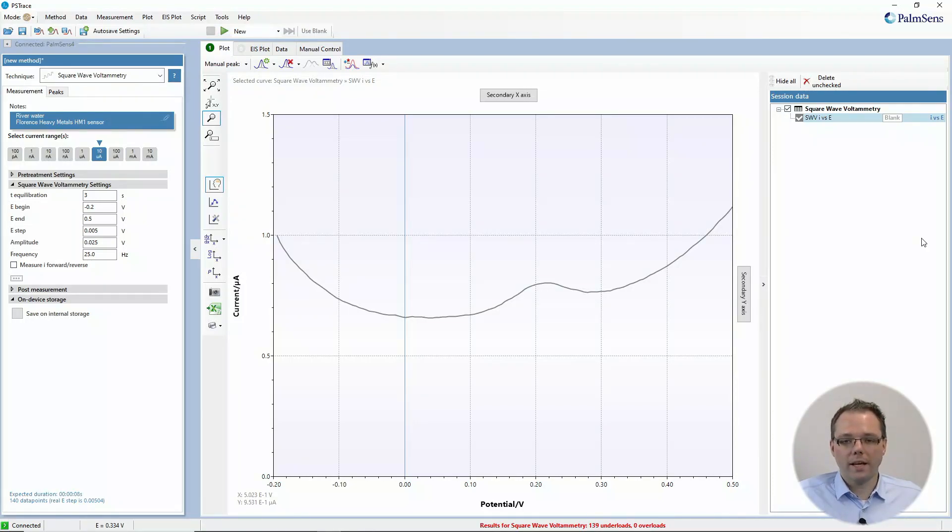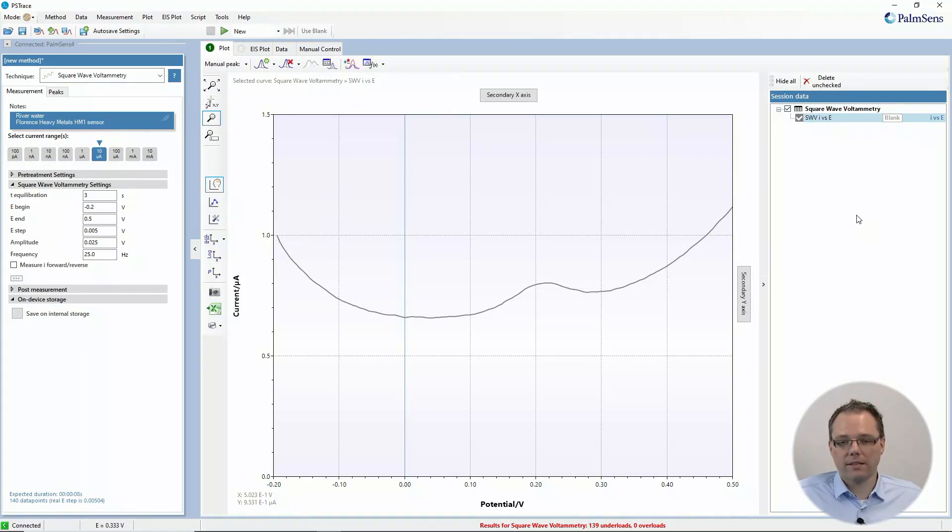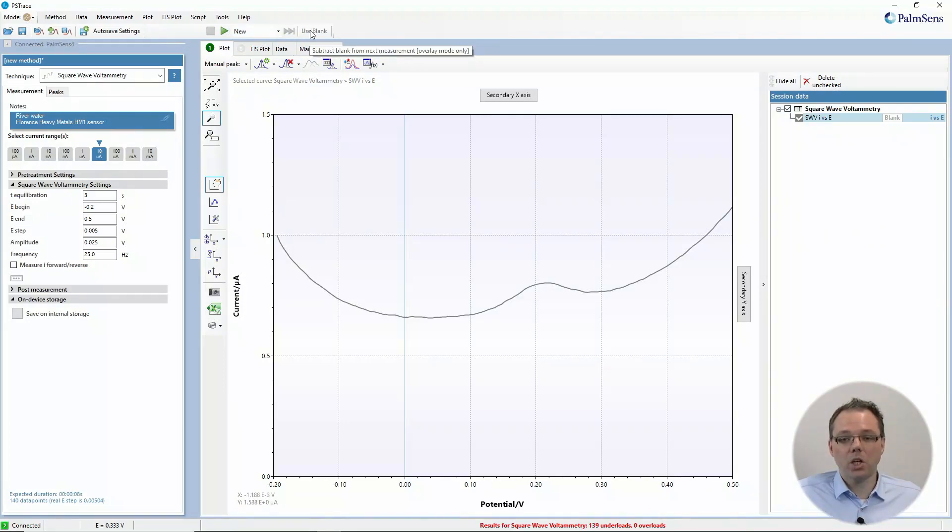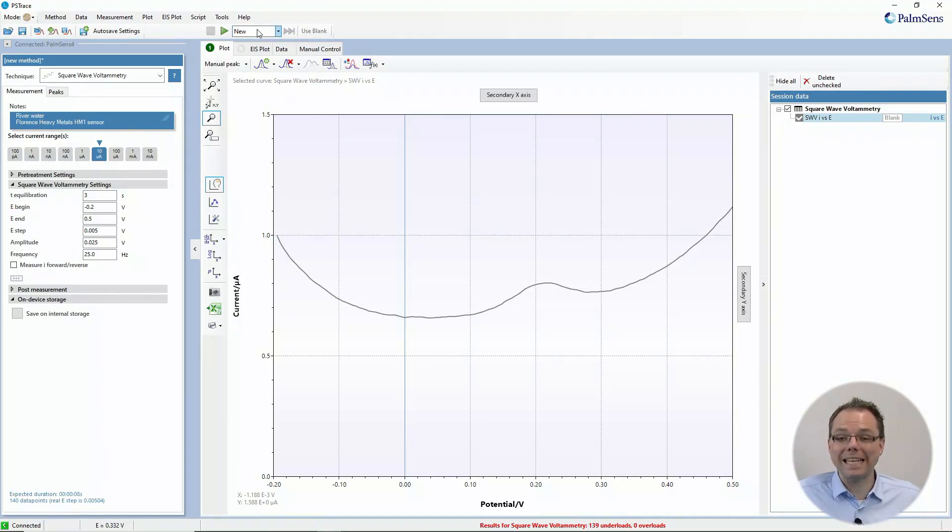Now we want for our future measurements that the blank is automatically subtracted. For this, we need to activate the 'use blank' button. However, at the moment we've chosen the option 'new' when we start a measurement, which means the plot is cleared completely, so we wouldn't have a blank anymore. We need to choose 'overlay,' and then this button becomes active and is already activated.